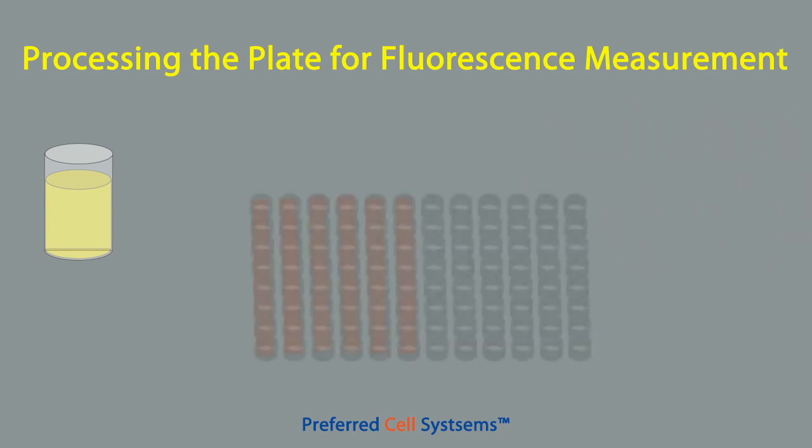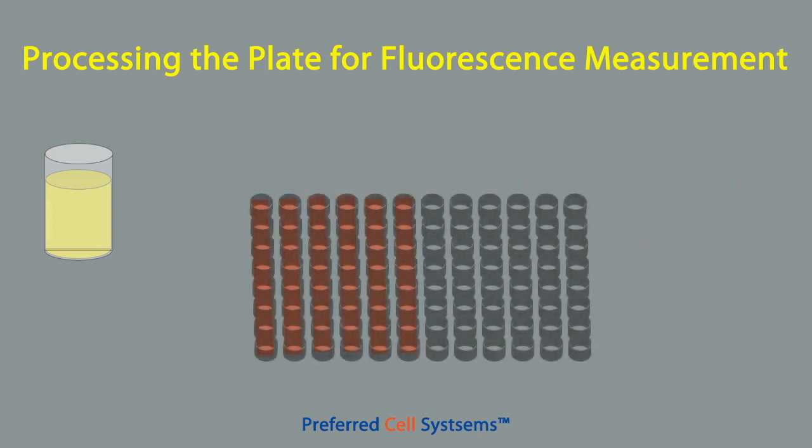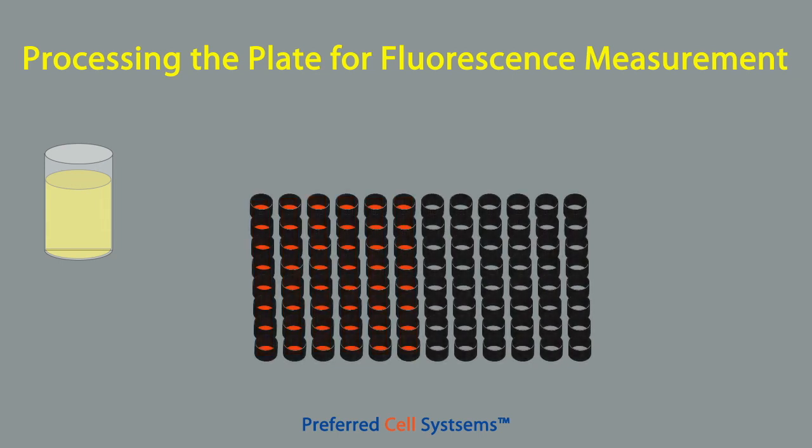Remove the 96-well plate from the incubator and let it come to room temperature. We are using only six columns of the 96-well plate. The plate will now be covered with the sterile adhesive foil that was included with the kit, so that the unused wells will remain sterile for later use.